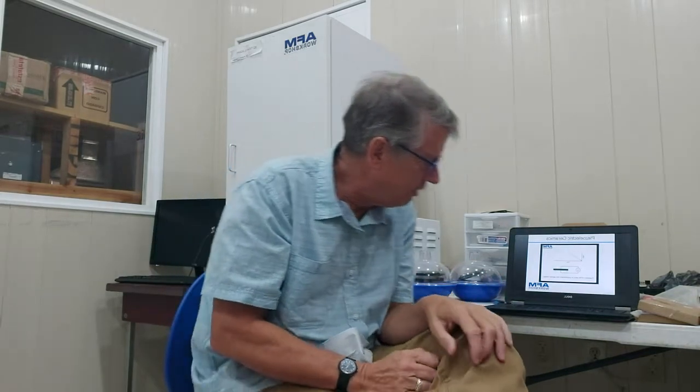Now if you put a voltage ramp on these ceramics, they expand and contract proportionally to first order. So they expand and they contract. Now, to second order, they don't. And so there's nonlinearities, and we'll talk about that later maybe. But basically, you put a voltage on it, it expands and contracts linearly.